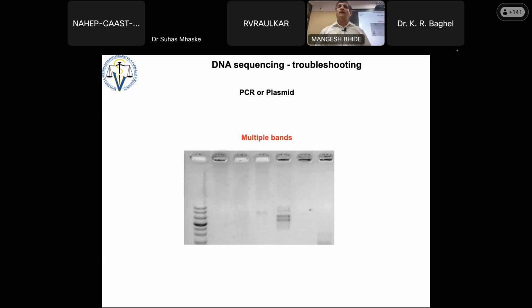Yes, but in this case, for example, your predicted product size is 1500, and this is 1400 something. So you never know which is your product. So in this case, I do not recommend to send PCR product. Always cut the band.